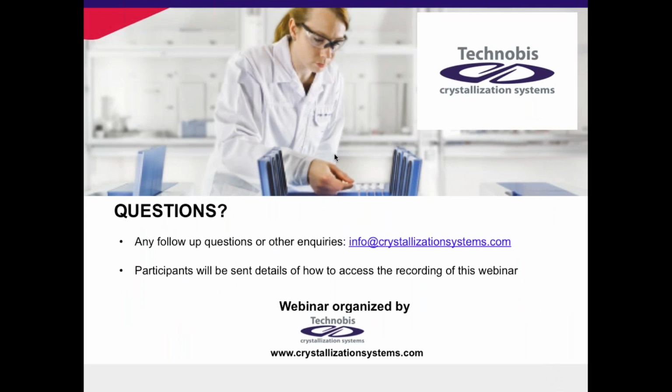Thank you very much, Thorsten and Vilmali, for this webinar. We have received a few questions that I will try to read to you. One of our attendees is asking, what would you suggest to do in order to monitor these polymorphic transformations related to metastable forms? How to catch them, what are a few rules that you would name to monitor this and to catch those that you cannot easily see?